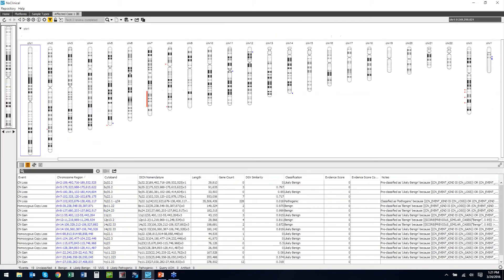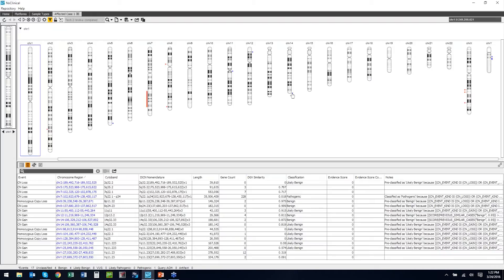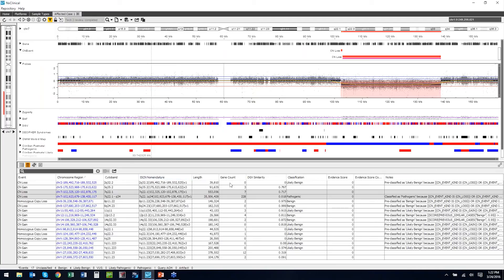Affected case one is shown here. At the top we see an overview of all chromosomes with our changes — red for loss, blue for gain. At the bottom is a table of results with a total of 17 events, most classified. In the table we have type of change (loss or gain), any allele call, chromosomal region with genomic coordinates, cytoband, ISCN nomenclature, length, gene count, DGV similarity score, classification, evidence score, and notes. I'll sort these first based on classification.